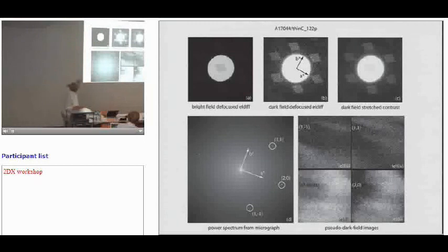So we've worked at this. And then this is a picture taken recently. And the last 3 slides is something we've just submitted. So here is a nice picture of paraffin, defocused bright field, with the beam illuminating it. And here is, if you change the gain level on the CCD that was looking at this, the direct beam is overloaded, and these are the diffraction spots defocused, the 4.1 and the 3.7 angstroms. And if you fiddle with the slope of the gain, you can see the crystal and the diffraction spots in the same picture. So that's all electron diffraction.